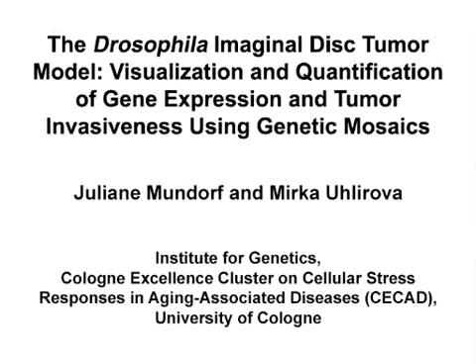The overall goal of this protocol is to demonstrate how to dissect the Drosophila eye antennal imaginal discs and brains carrying genetically defined fluorescently marked clones, and how to process them to visualize and quantify gene expression changes and cell invasiveness. The described procedures can help to provide novel insights into the role of genes in epithelial development, homeostasis, or disease, and to dissect mechanisms underlying cell competition, compensatory proliferation, or interclonal cooperation.